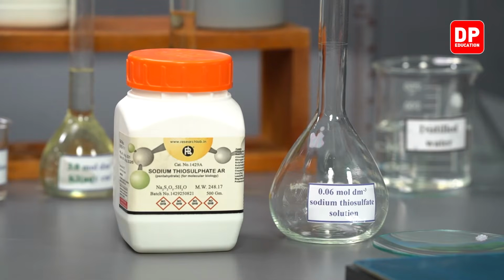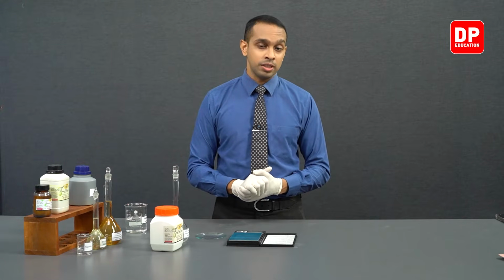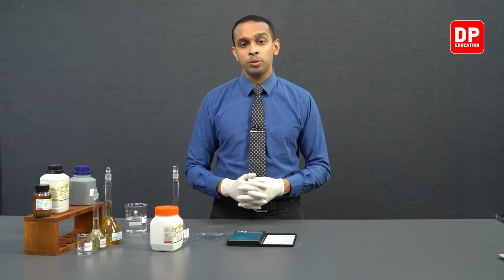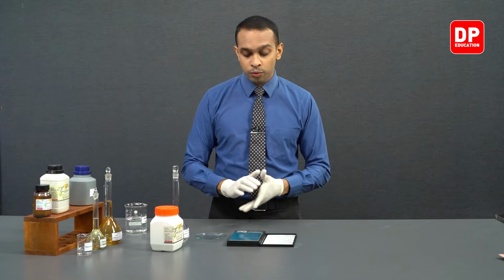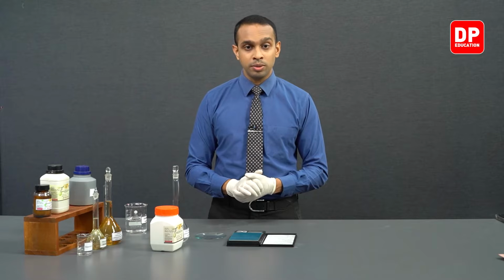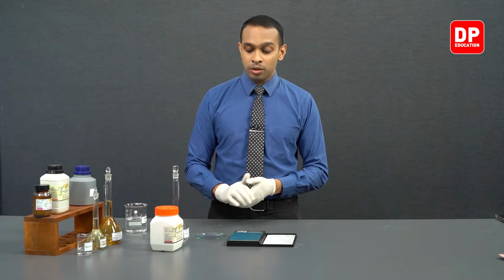So this is a 250 milliliter volumetric flask. If you calculate the mass that you need to measure to prepare the solution we need for this experiment, the mass would come up to 3.72 grams.